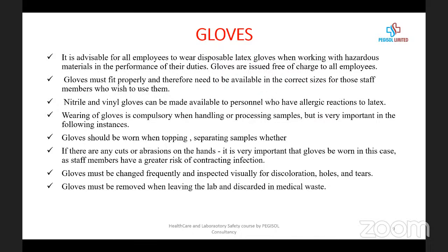It's expedient that you do the needful by wearing your hand gloves.